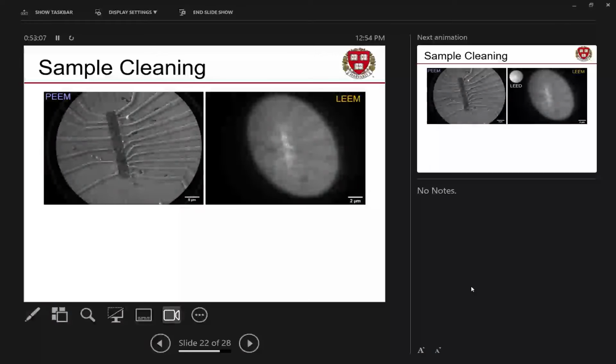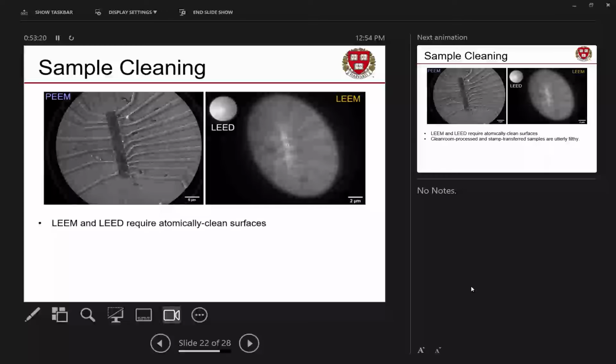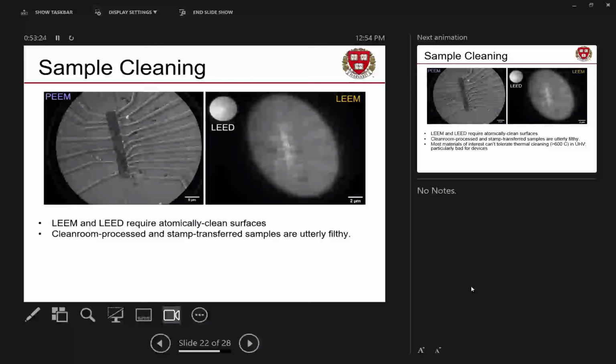If we take this same thing I showed you in PEEM before, we look at it in LEEM, oh boy, does that look weird. There is stuff all over this sucker. And that's because, yeah, there's no LEEM pattern at all because it's so dirty. That is because we need a really atomically clean surface. And this thing was made in the clean room and the graphene was put there using something called stamp transfer. And things made with stamp transfer are unbelievably dirty, like just filthy. They got stuff in between the layers, they got stuff under the layers, they got stuff on the layers, it's terrible.